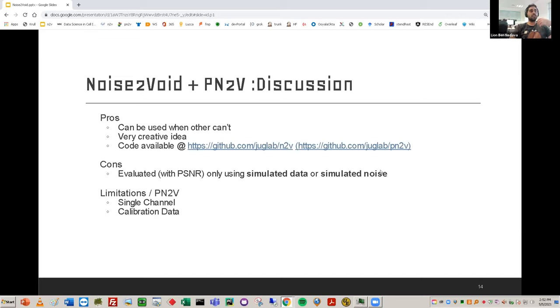Yeah, I think it's interesting to see if all that hard work done in PN2V is actually worth it, or you can take just N2V and get good results. Well, I'm sure that because you have the distribution of the noise, you must get better. But again, I don't have any comparison. Maybe it's worth looking for.